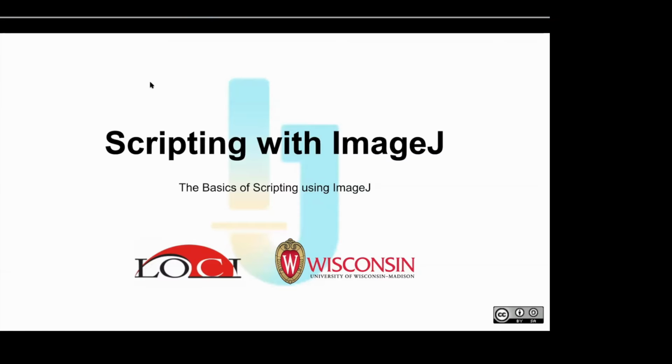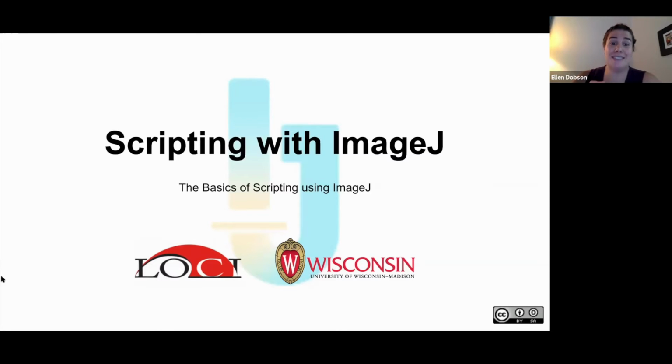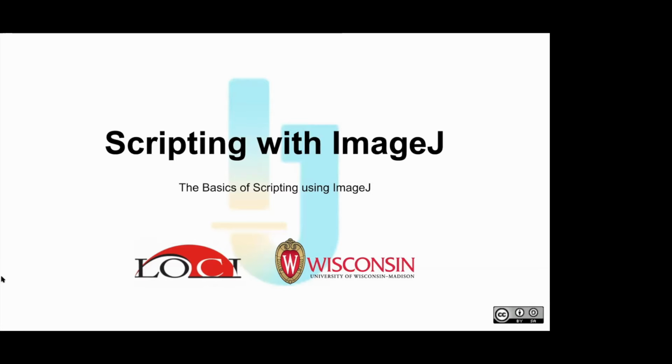I was looking at a signal within those nuclei. Usually if you have a Z stack and you compress all of them into one plane, it asks whether you want average intensity or maximum intensity, right? So I was wondering, based on how you choose those, let's say I chose maximum intensity, is it changing the data? Because if you do maximum intensity and then measure, it's not going to be the same as measuring each individual plane. Correct. So how would I deal with that data is what I was trying to figure out.